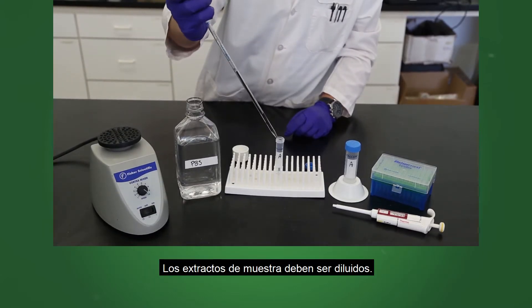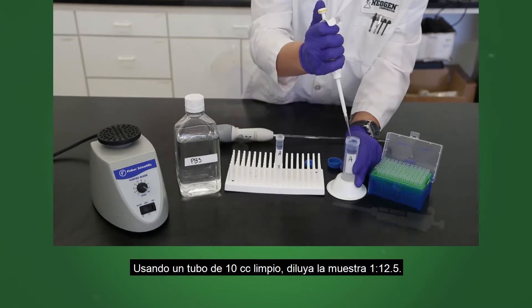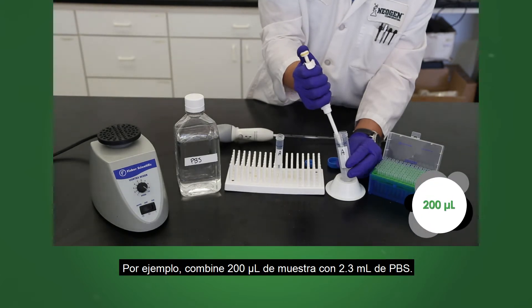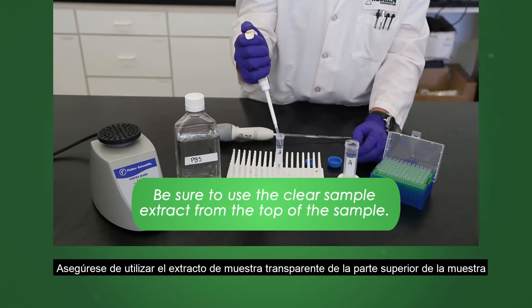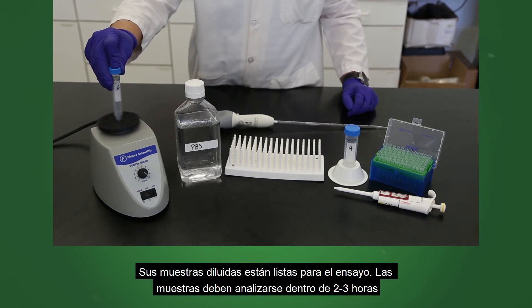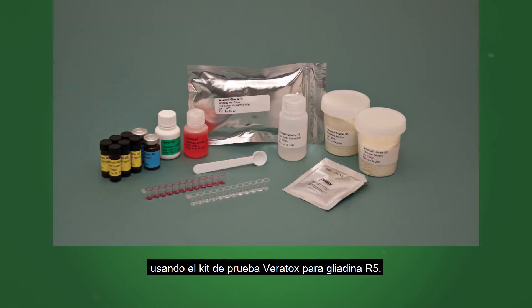Sample extracts must be diluted. Using a clean 10 cc tube, dilute your sample 1 to 12.5. For example, combine 200 microliters of sample with 2.3 milliliters of PBS. Mix by vortexing for 5 seconds. Your diluted samples are now ready for the assay. Samples should be analyzed within 2 to 3 hours using the Veritox for Gliadin R5 Test Kit.